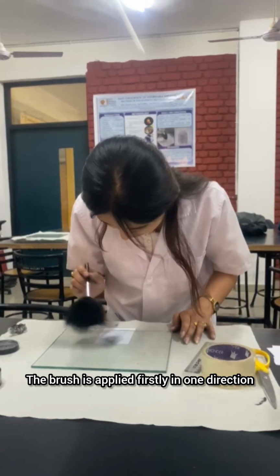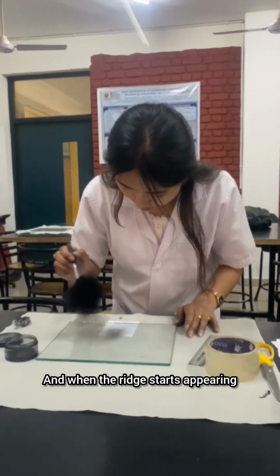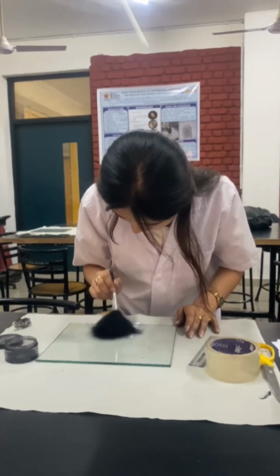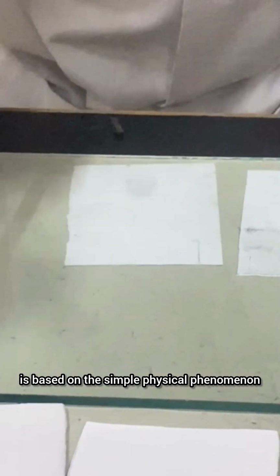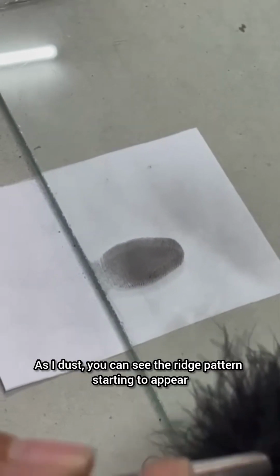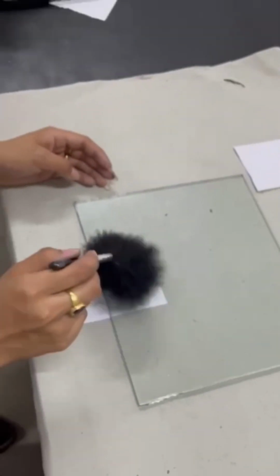The brush is applied first in one direction and then in the other direction, and when the ridges start appearing, the brushing is done in a way that its motion follows the flow of the ridges. This method of developing latent fingerprints is based on the simple physical phenomenon of adhesion. As I dust, you can see the ridge pattern starting to appear. That's the latent print being developed.